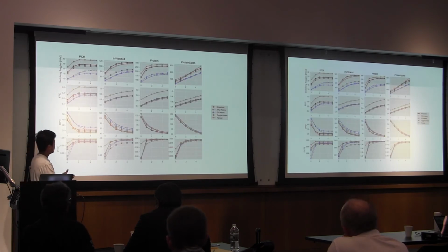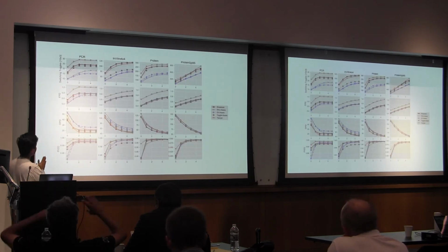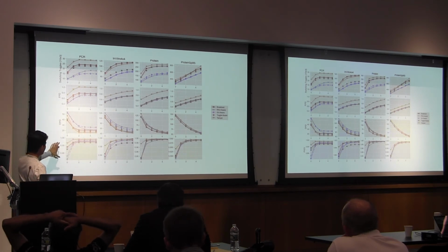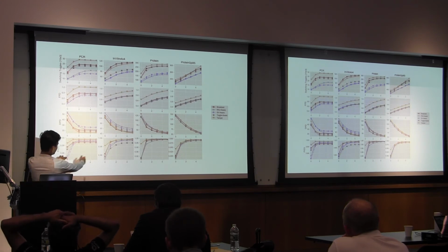And we have a bunch of data here, so I'll just quickly summarize. We have 4 different assays in the columns, and the probability of detection is in the bottom row. We can see here that the tamper-resistant pin mapper has the highest probability of detection out of all of them right off the bat with 0 indicator droplets. As you add indicator droplets, you get closer and closer to the ideal probability of detection, which is 100%.